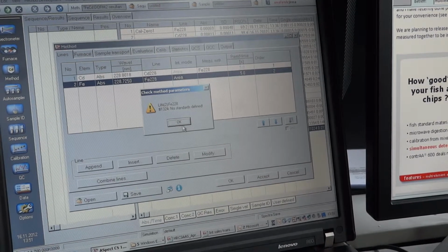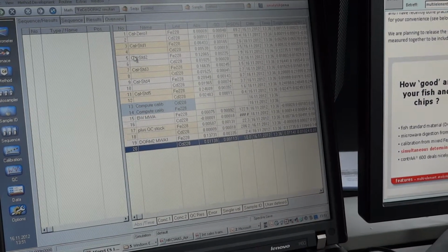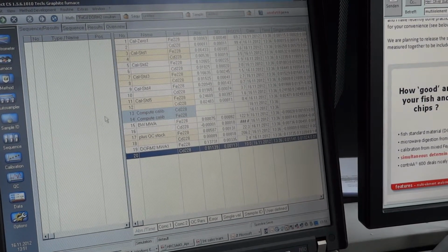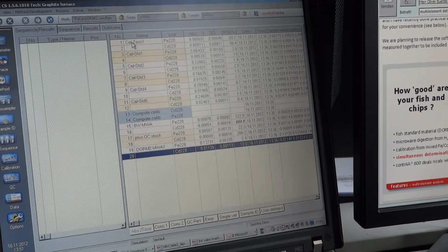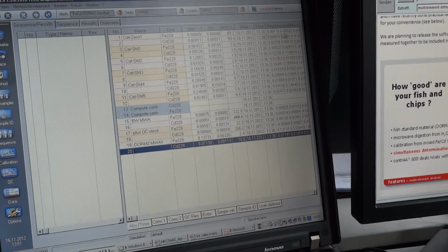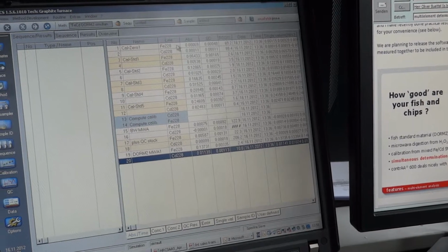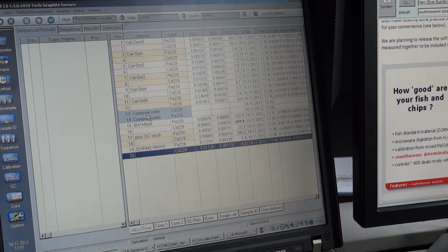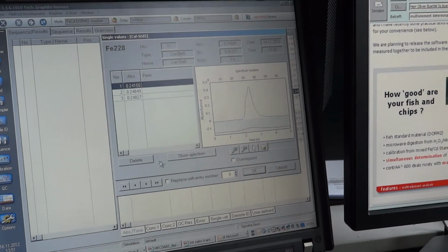So once that is done, you create your sequence of samples to be measured or calibration to be carried out. And what you end up with is a typical sequence where you have your calibration standards, and you see the iron line here being measured first, the cadmium line being recalculated after the determination of the iron was completed, and then it does that for every individual step. And you can get calibration curves for both of them.